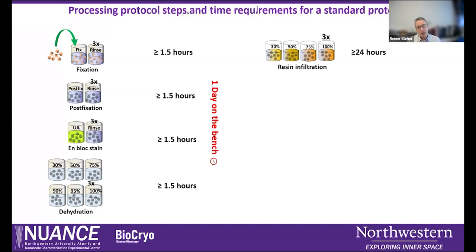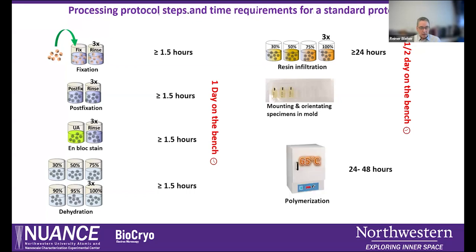And in the next morning, we still have to do some liquid exchanges with the resin before it's ready to be transferred into molds and can be polymerized. So this is another half day that we have to invest. And then the sample, of course, gets polymerized and we can proceed as usual.